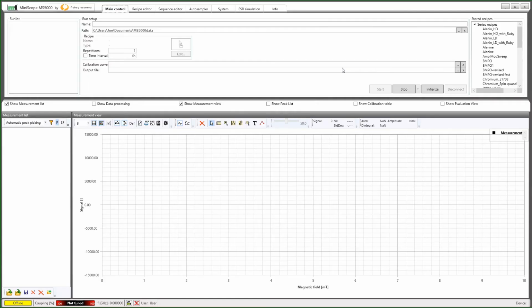The software you see here is the ESR Studio software. This software allows control of the MS5000 via the Ethernet connection using an IP address. Normally you don't use this software in routine operation, as you will use the Ariel software for dosimetry readings, calibration, and such. This software runs underneath the Ariel software to actually access and run the ESR system.